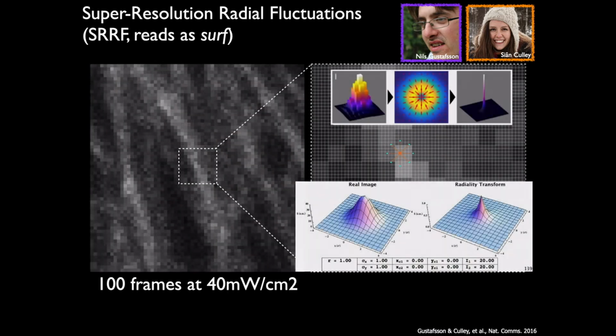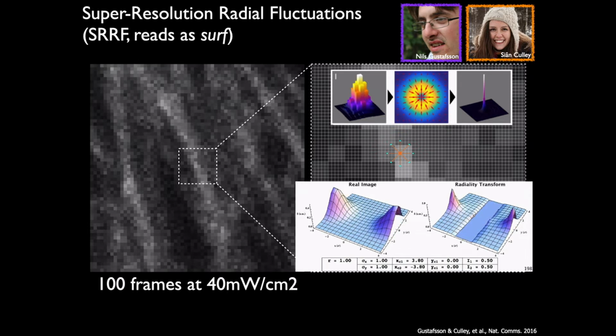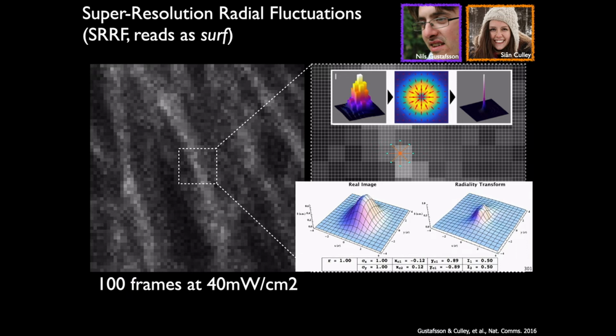So if that is true, we can actually use a mathematical transform, which is a radial symmetry detection transform, that tries to pinpoint that there is something that looks like a fluorophore actively emitting in a moment in space that is distinguishable from anything in the vicinity.